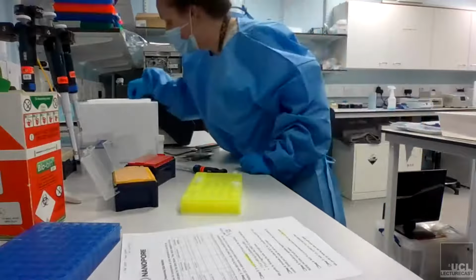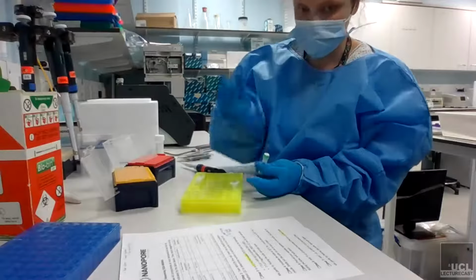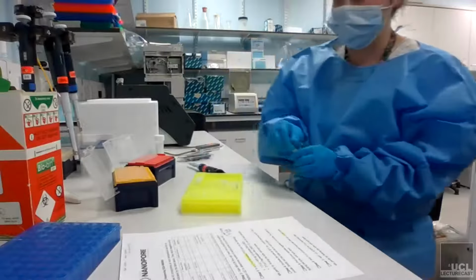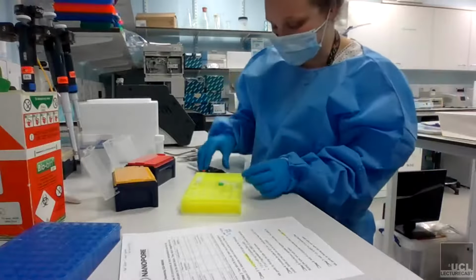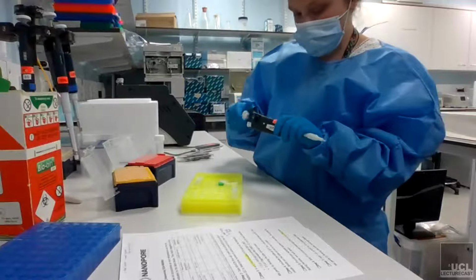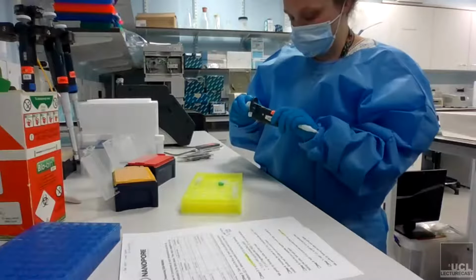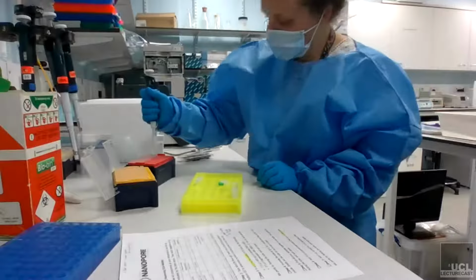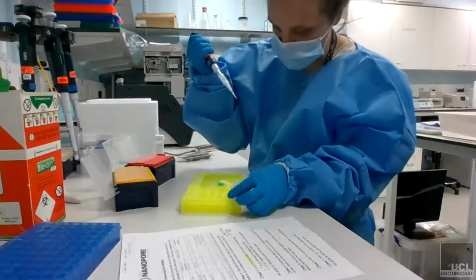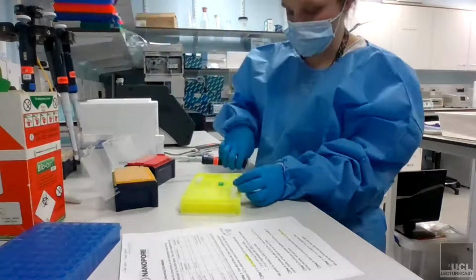Now we're going to add the rapid adapter. This is a protein, I believe, that sticks to one of the ends of your DNA to help pull it through the pore. Hopefully Nanopore will correct me if I'm wrong. You just need 1 microliter. You can mix your rapid adapter by flicking the tube and then spinning it down, which I did previously. So I want 1 microliter of my rapid adapter, and I'm putting it into my 10 microliters of sample.